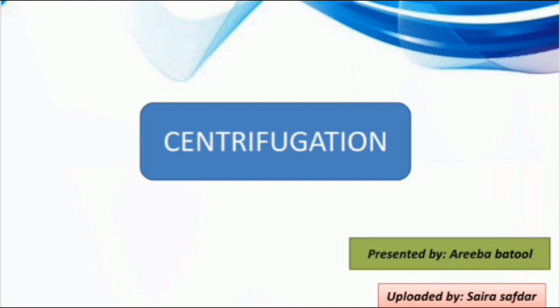Today I'm going to present the topic centrifugation. In this video we'll discuss its definition, its discovery, instrumentation, working principle and its application. So let's start the video.